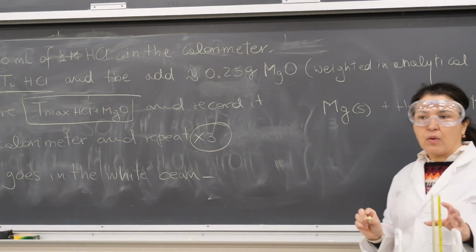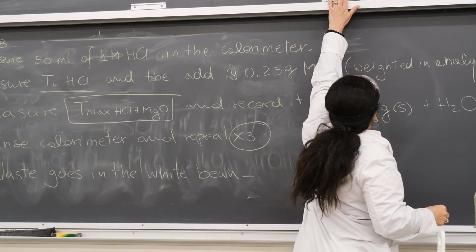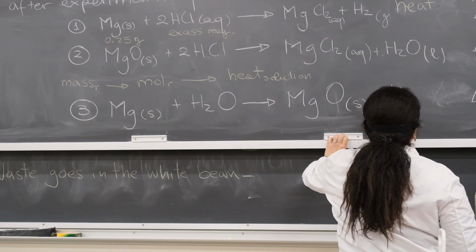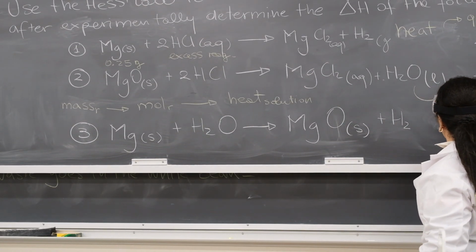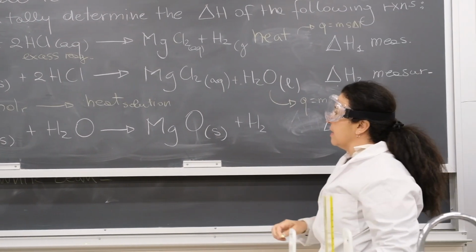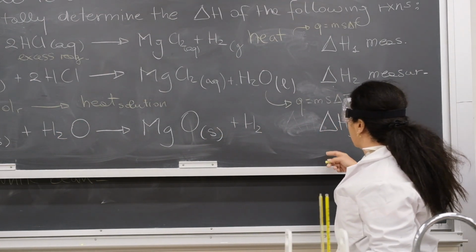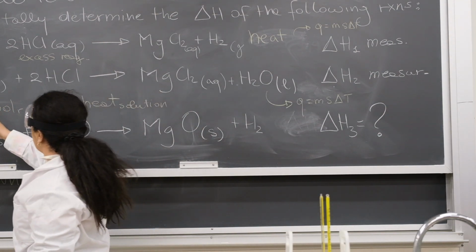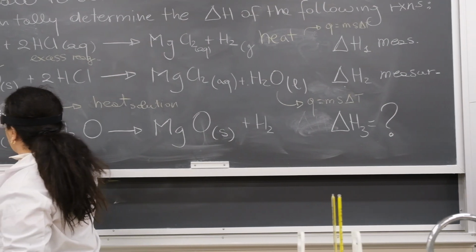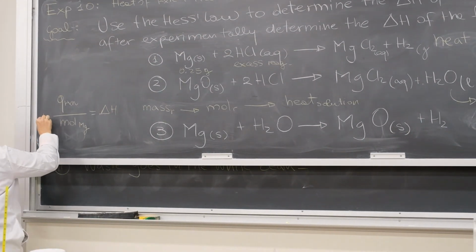Okay, so now let's go one second to the calculation. So we are calculating the Q for reaction 1 and the Q for reaction 2, assuming, as I said earlier, that the solution is extremely diluted, okay? Then what we are going to do, we are going to calculate also in the second case, from the heat of the solution for this reaction, the delta H, this is for reaction 1.